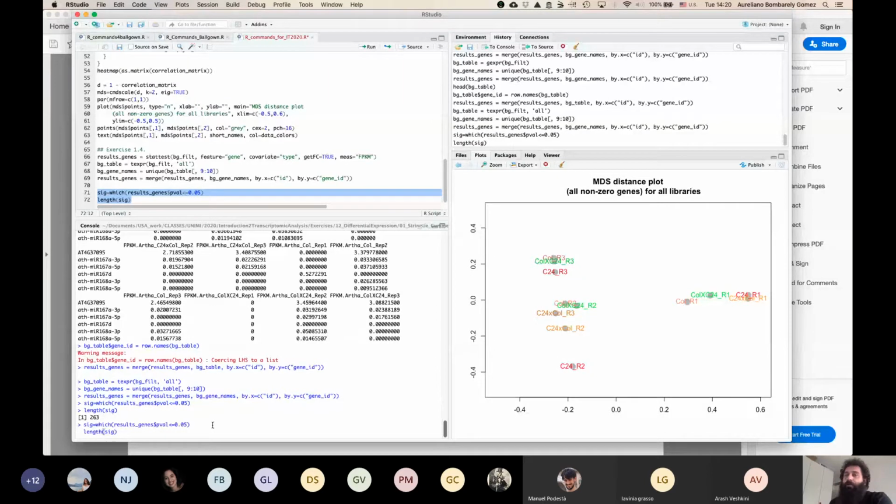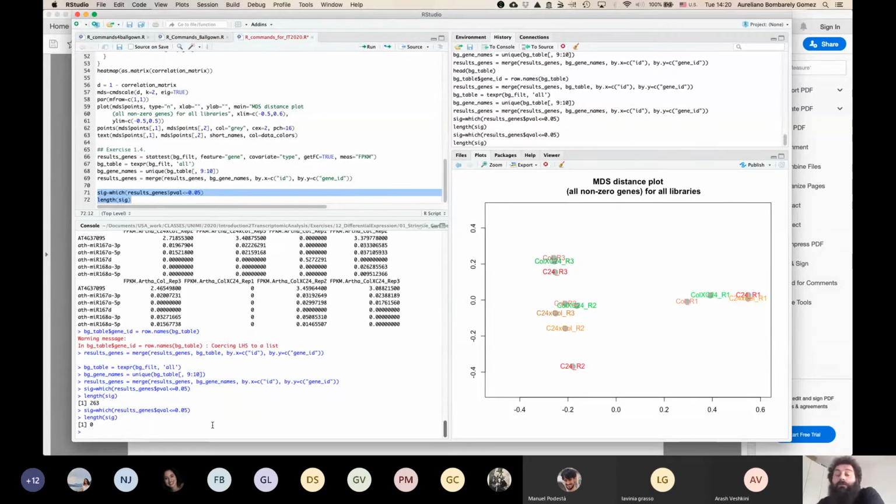If instead of p-values we want to use q-values, remember that potentially we could use q-values, we have 0. So it means that when we are using the false discovery rate, we will not have significantly different genes. So we can suspect that these 263 genes are false positives, because when we run a false positive correction, we get rid of those. At some point, false positive correction also depends on the variance, so sometimes you want to still keep balance.